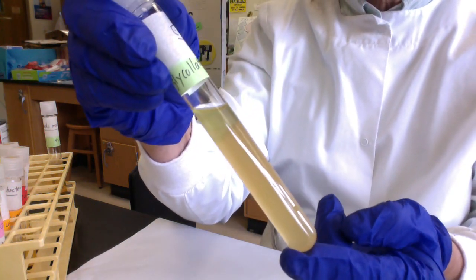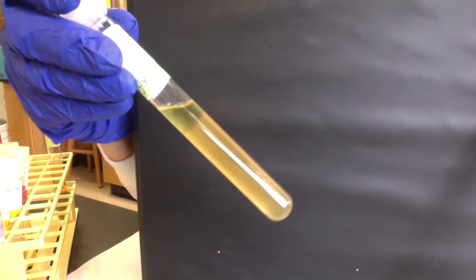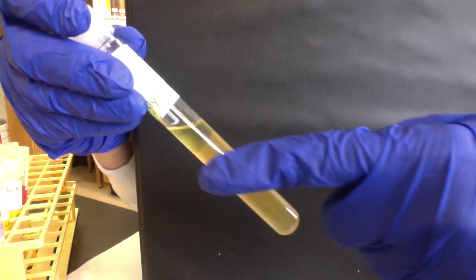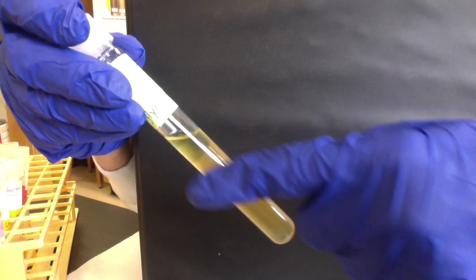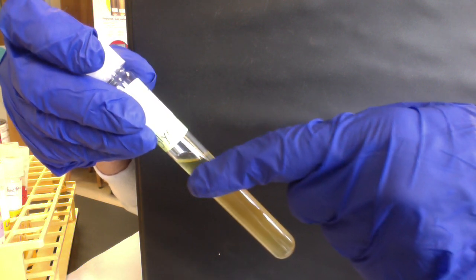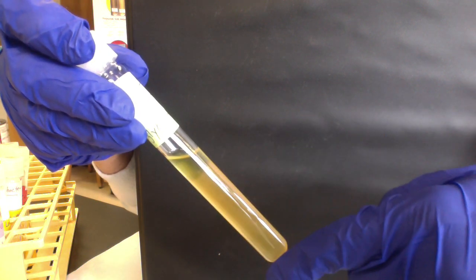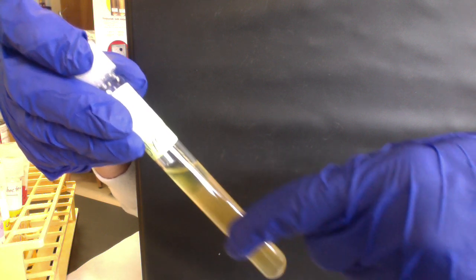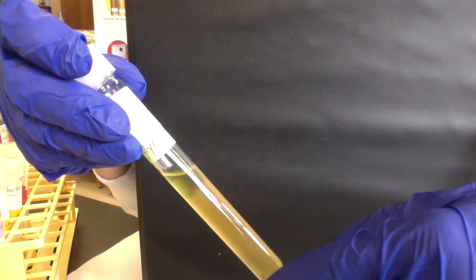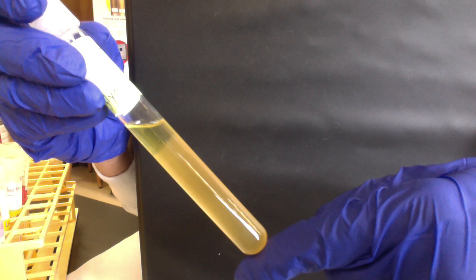We can see that E. coli is growing throughout the tube. This tells us it can grow both aerobically and anaerobically. This is positive for anaerobic growth. Can your microbe grow anaerobically? Yes, it can—positive for anaerobic growth.